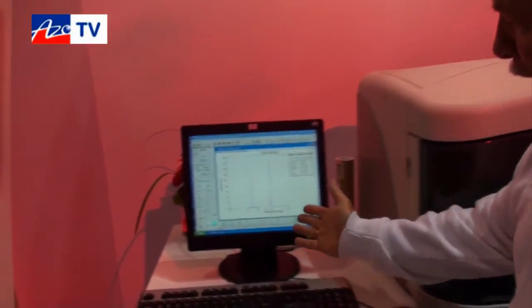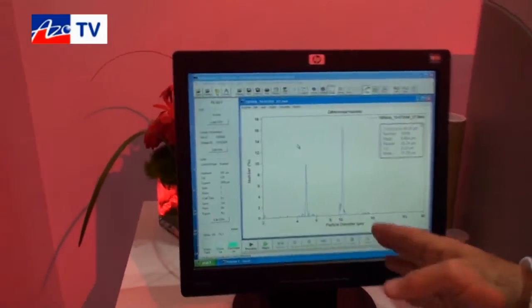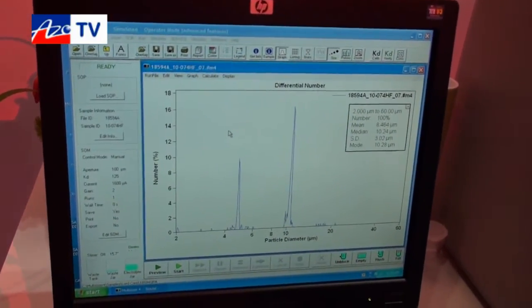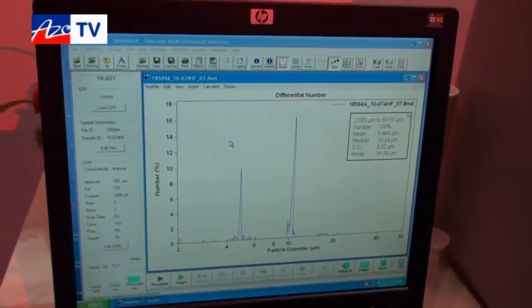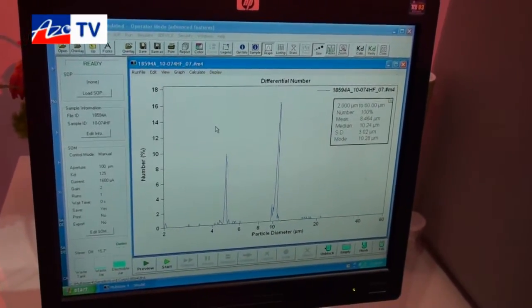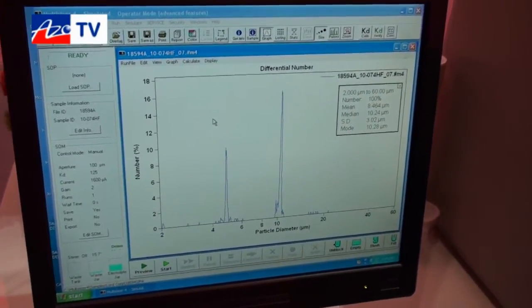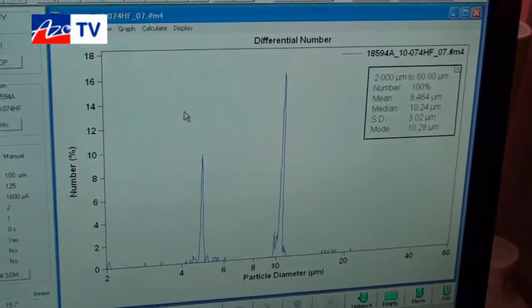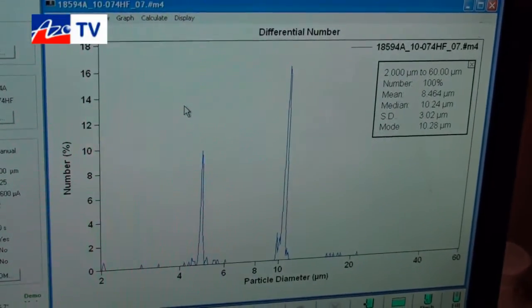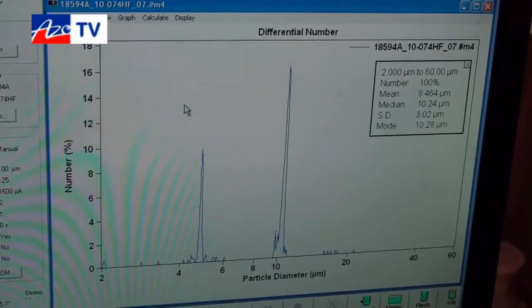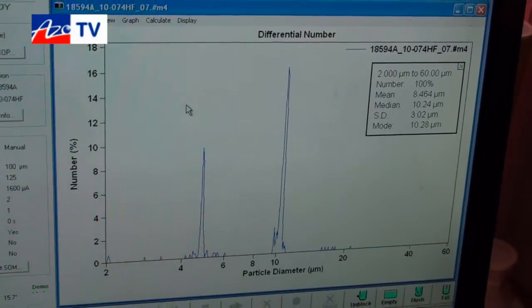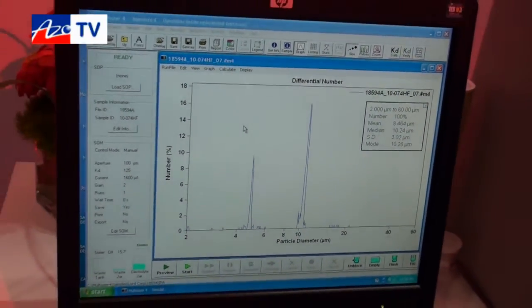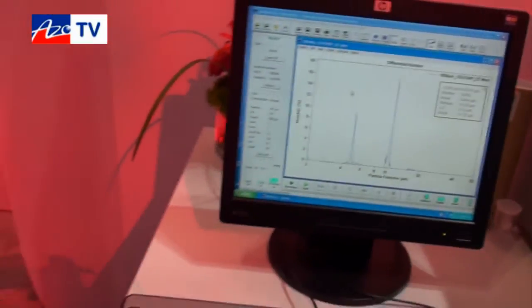The interface is a basic PC showing here the results of a couple of narrow distribution materials. The Coulter counter Multisizer series is the highest resolution technology available on the market for particle characterization. It actually counts and sizes individual particles, and this is the most accurate way.